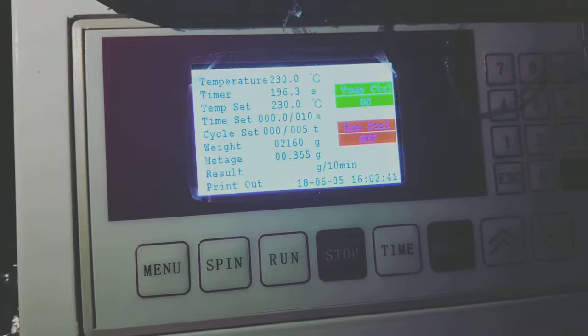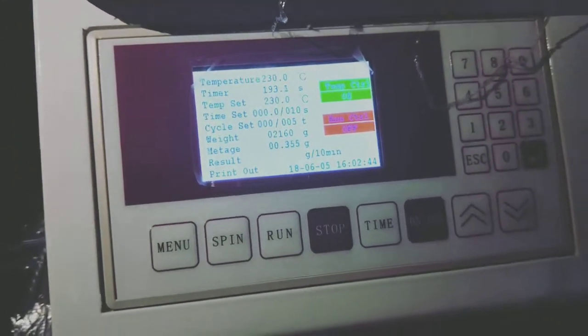Now we need to wait for this time to calculate to zero. And then we can add the sample and extrude the sample.